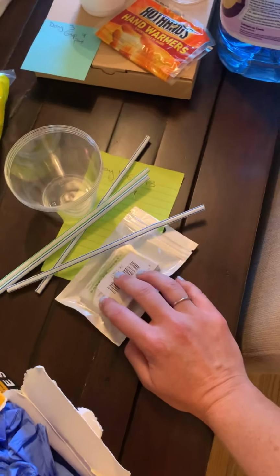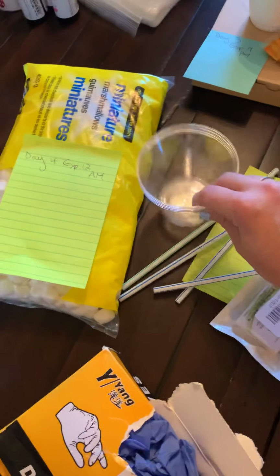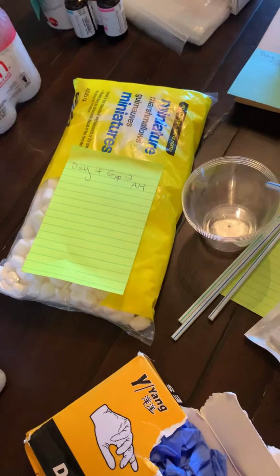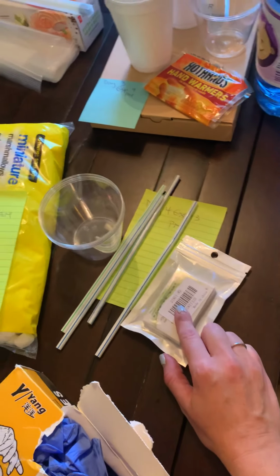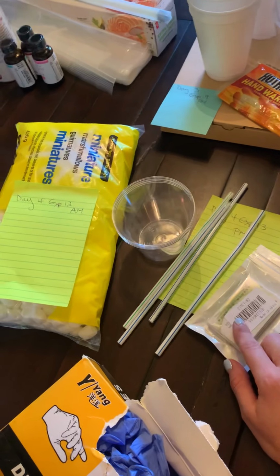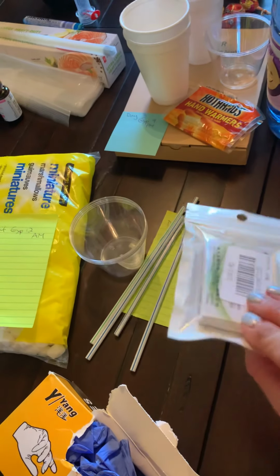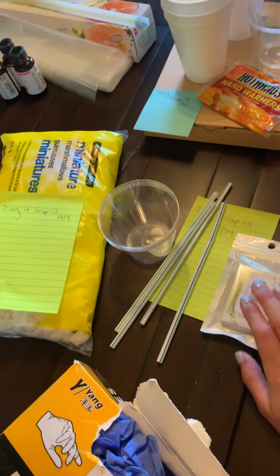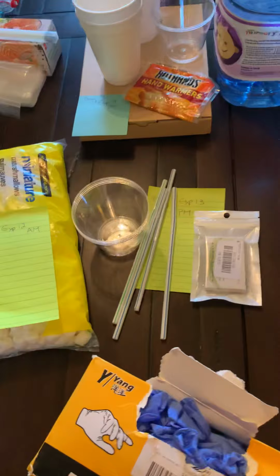Last one of the day on day 4 is we're just going to talk about pH and carbonating water. So we're going to fill up some water, we're going to blow some air into it, and then we're going to test the pH. I'm also going to make cabbage juice indicator for this, which is a fun different color indicator compared to just pH paper. You can get pH paper anywhere where people sell aquariums, like pet stores, but cabbage juice indicators are really easy, and you can get cabbage leaves from the grocery store.